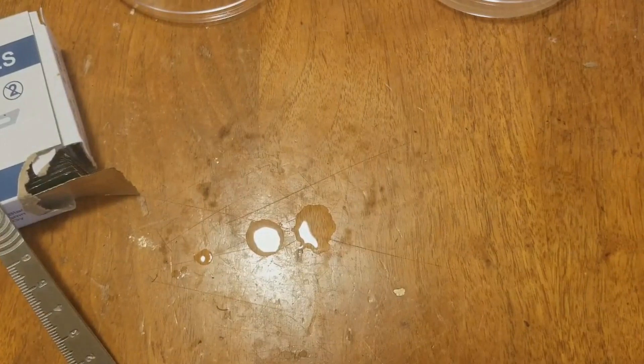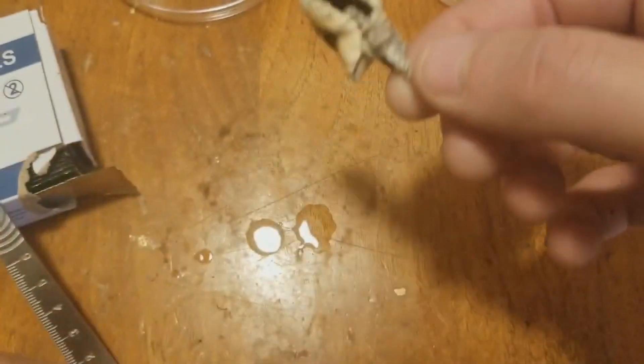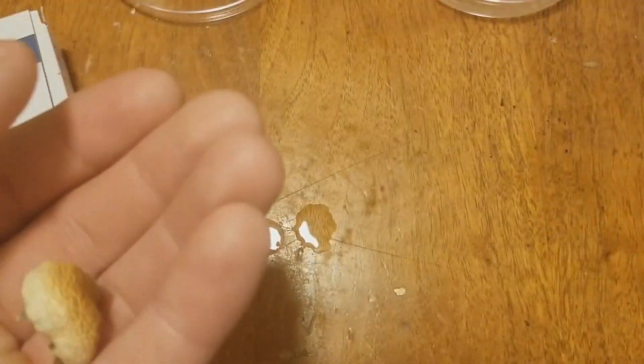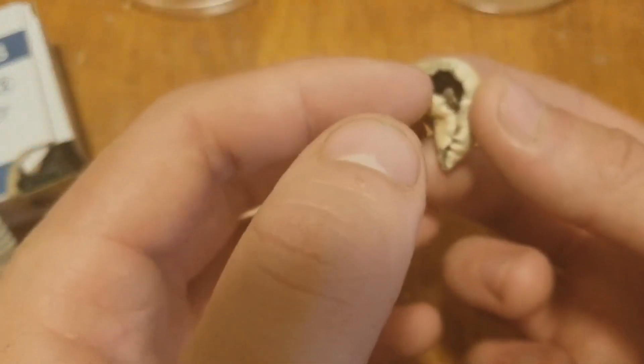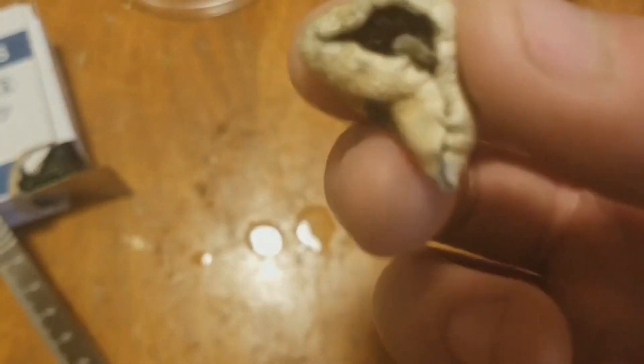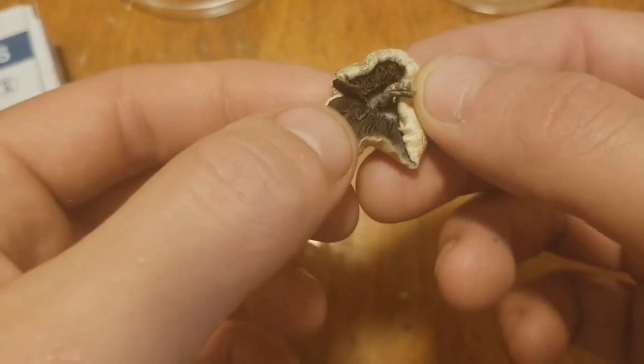Grab yourselves a nice mushroom and we're going to be using the cap, so you can just go ahead and rip it apart. I like to use the inside — I chose one that's kind of closed off. I'm going to be getting inside there to take my sample, so I'm just pulling it open.